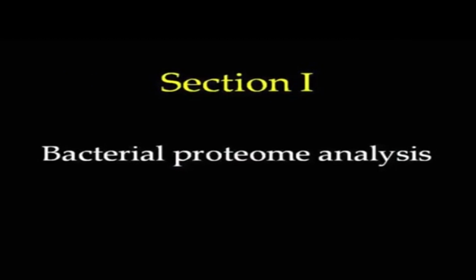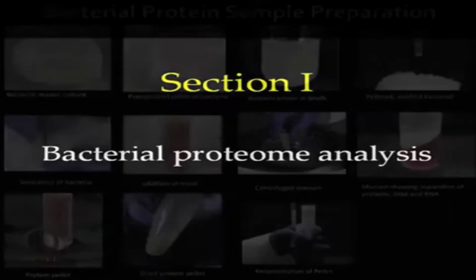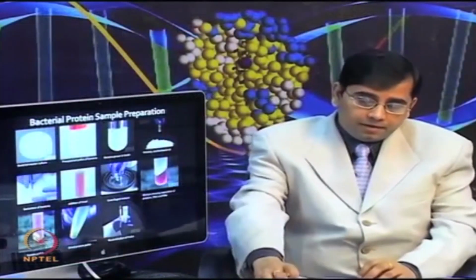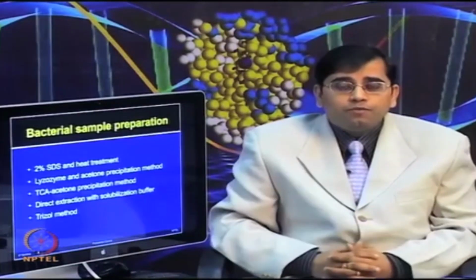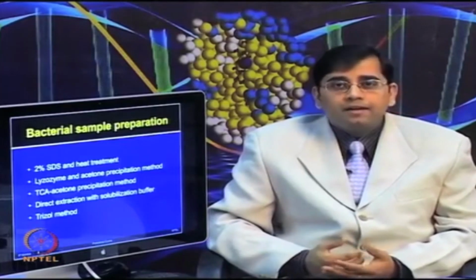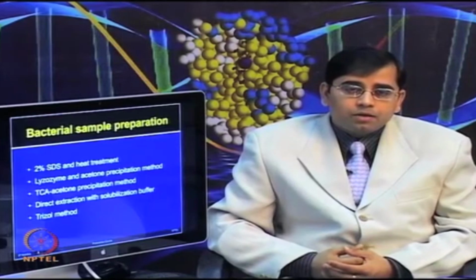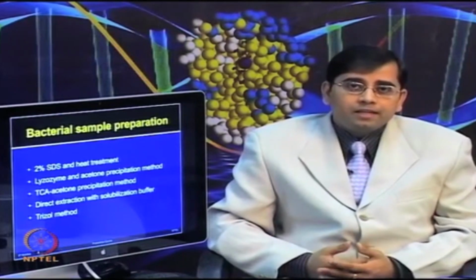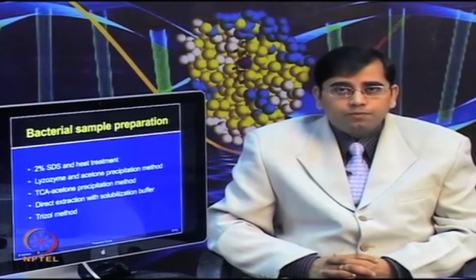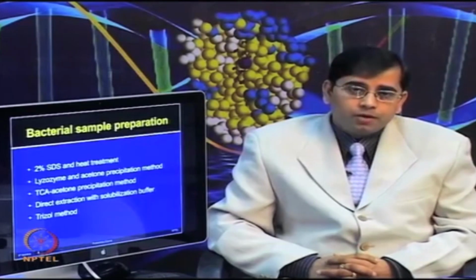Okay, so let us start with the bacterial proteome analysis. This slide shows the various steps involved in bacterial protein sample preparation. Now let us elaborate on this and look at the different sample preparation strategies which people apply for bacterial protein extraction. These are all reported methods available in the literature. I have just compiled them for your brief overview. For the detailed protocol of each, you can refer to the original publications.